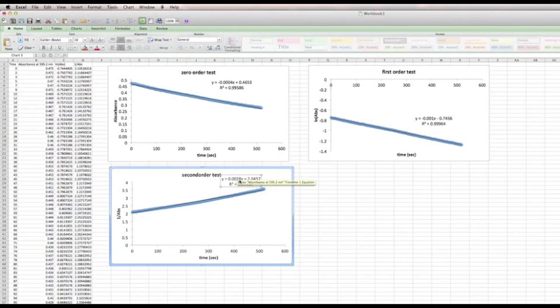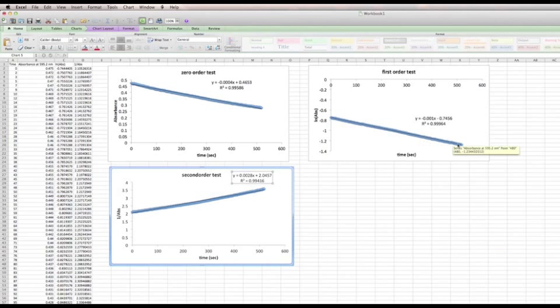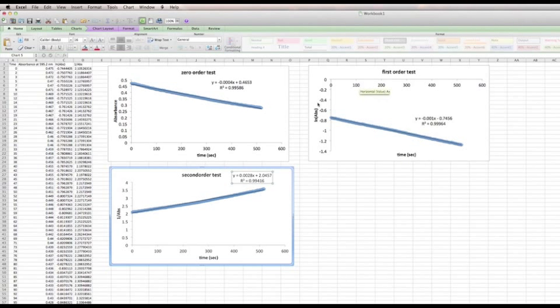If you do that, you can compare the R-squared values, but it's most important to look at the graph itself — these R-squared values are all really good. If you notice, one is slightly better, and if you look carefully, some graphs have a bow on one side or the other. My data clearly appear to follow a first-order relationship.